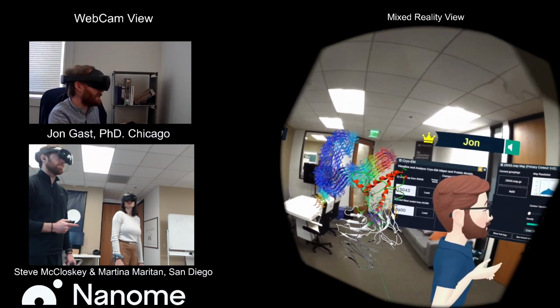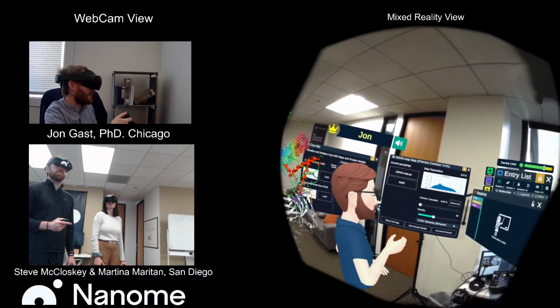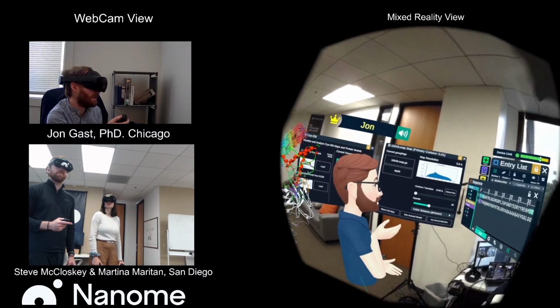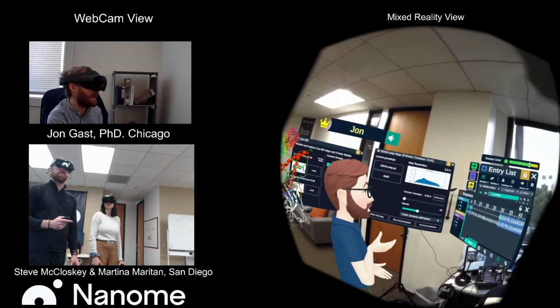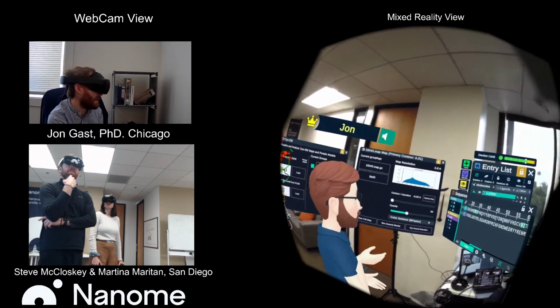Now if I go into the sequence menu, and I'll make this a little bit larger for everybody to be able to see, I can go to 1TPX and I can go into 8A00. I'm going to align the two. And we can see there is a little bit of overhang here, but overall we can easily see the alignment.